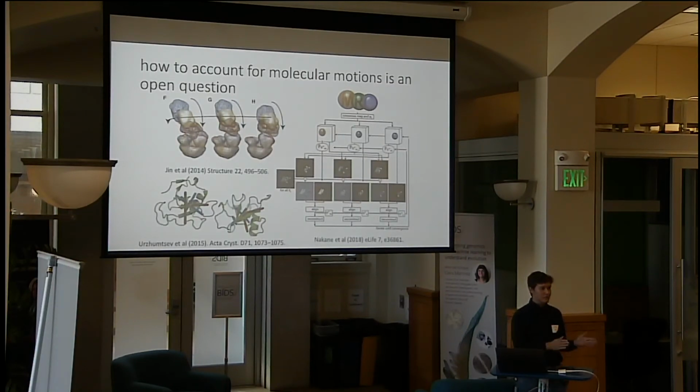And so the simplest treatment is to treat all motion as a source of noise. And if we don't want to treat all motion as a source of noise, the next simplest approach is to classify our data set into a whole bunch of different sub-data sets, get a whole bunch of different pictures of horses, and then try to analyze at the end how they relate to each other. And this has the major disadvantage, especially if you're looking at a wide range of motion. You have to cut your data set into that many individual pieces. Your signal to noise is going to suffer based on how many times you have to cut your data set.